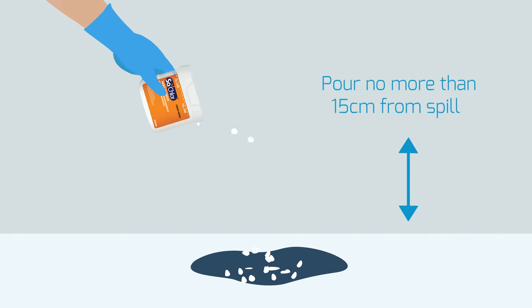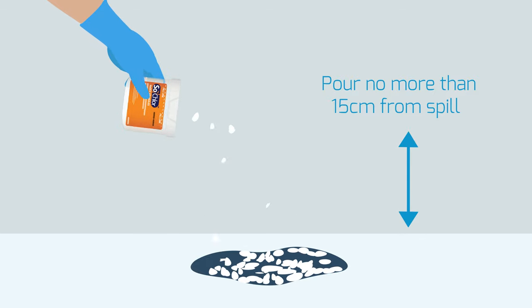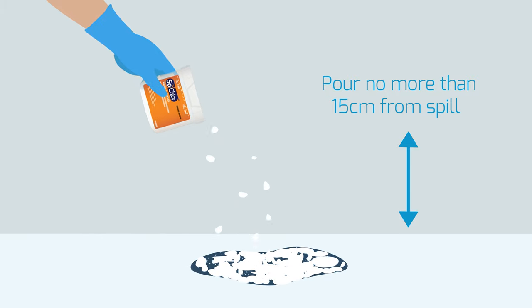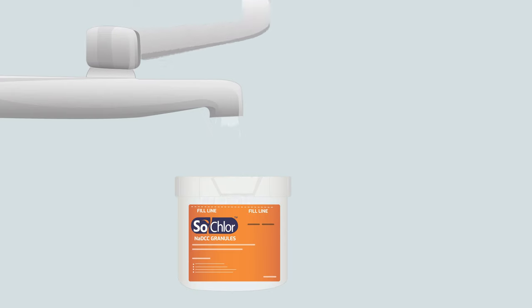Remove the lid and sprinkle the SoClor granules over the spill, ensuring it is completely covered. As well as absorbing, the SoClor granules will also start the disinfection process. This provides additional safety benefits over standard absorbents and reduces the cross-contamination risk.